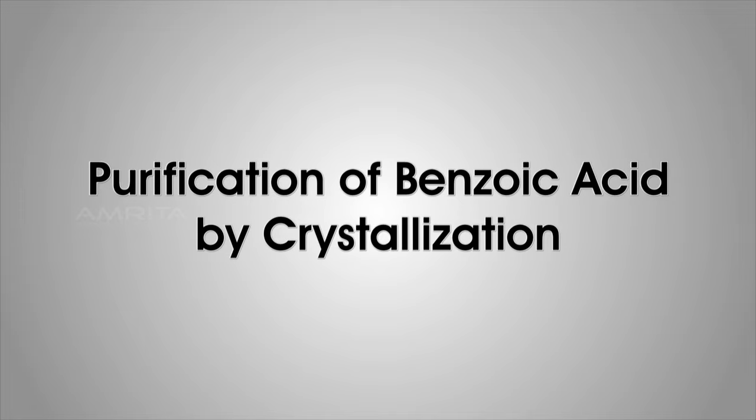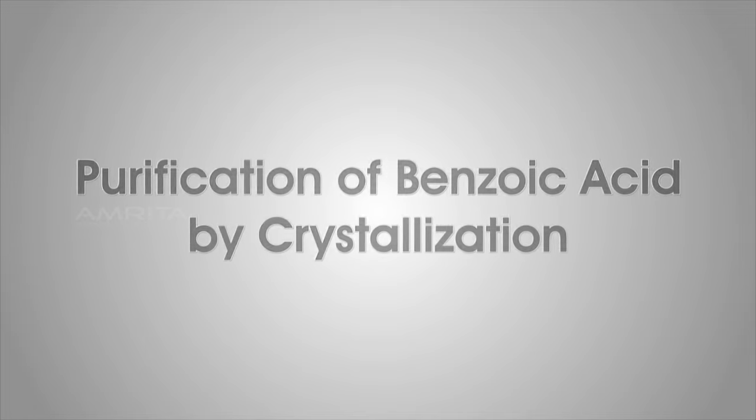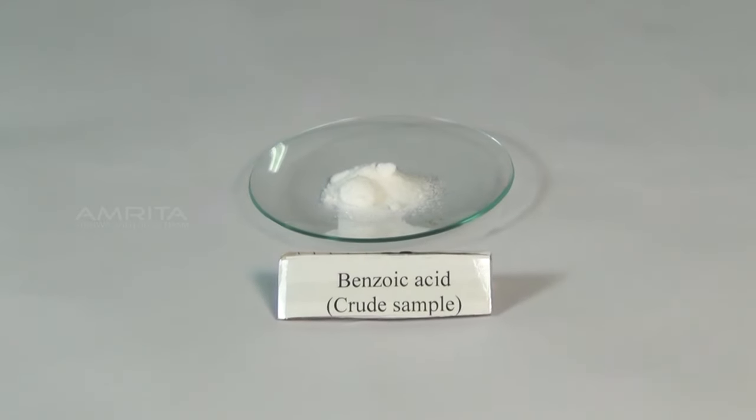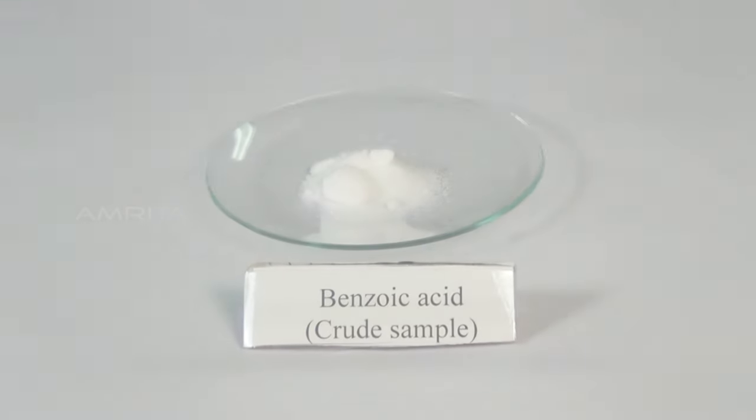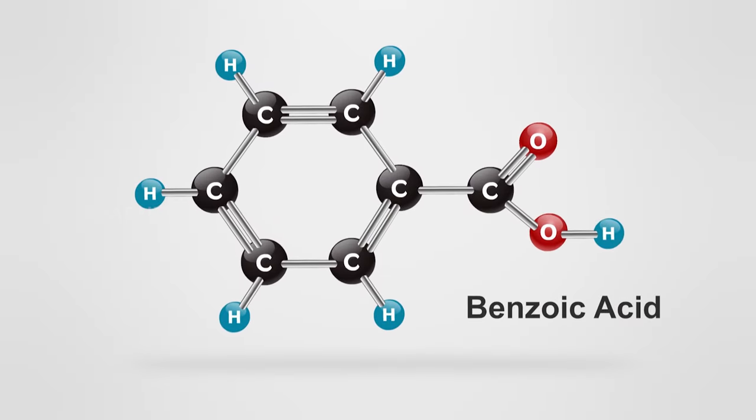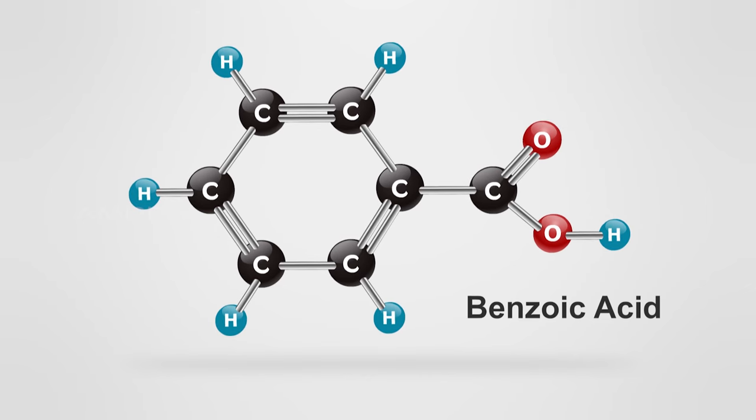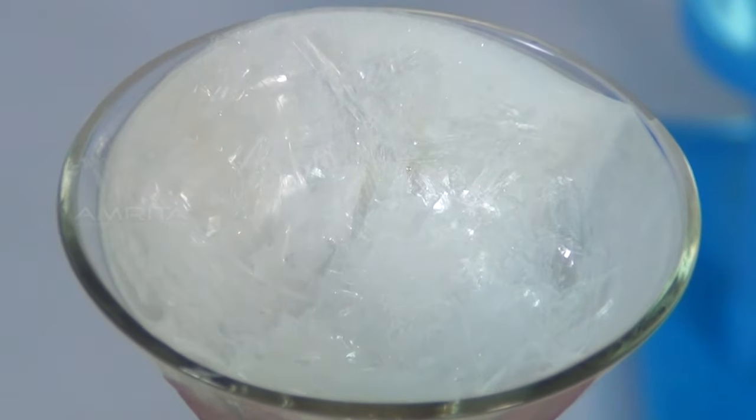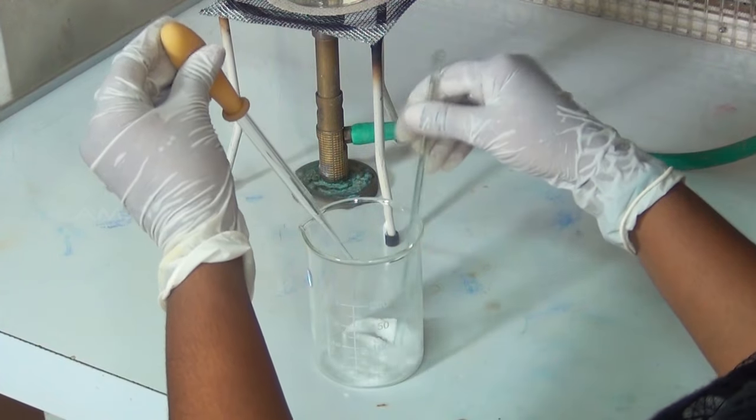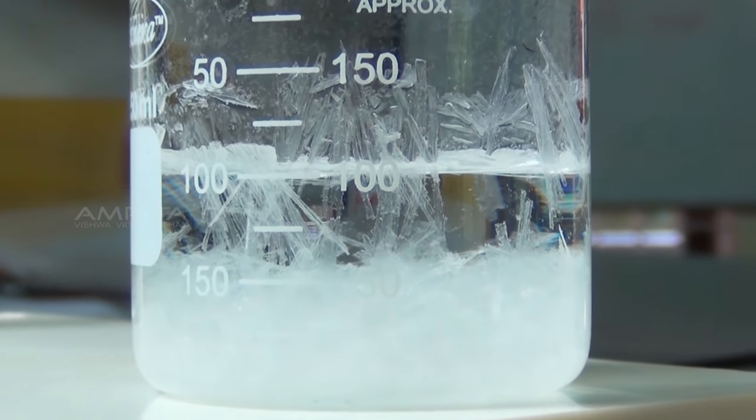Purification of Benzoic Acid by Crystallization. Benzoic acid is a colorless crystalline solid and it is an aromatic carboxylic acid. The pure crystals of benzoic acid can be prepared from an impure sample by the process called crystallization.